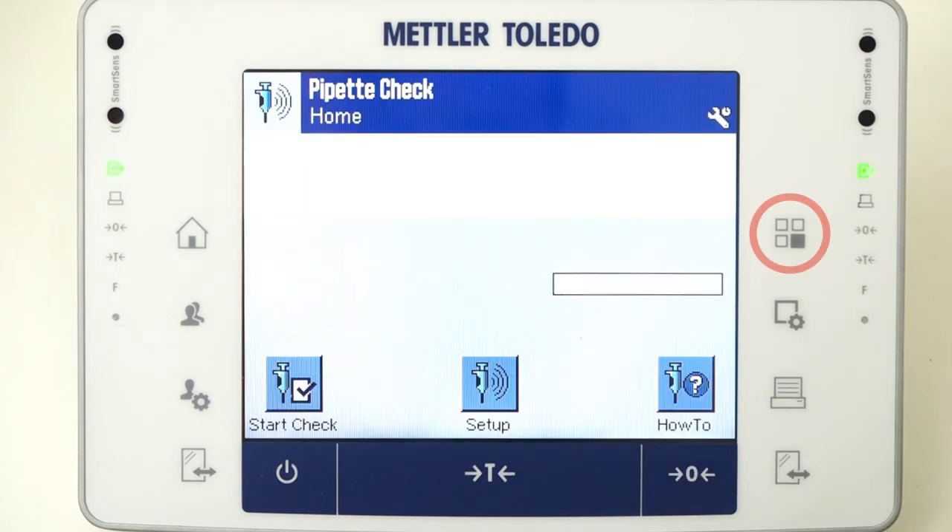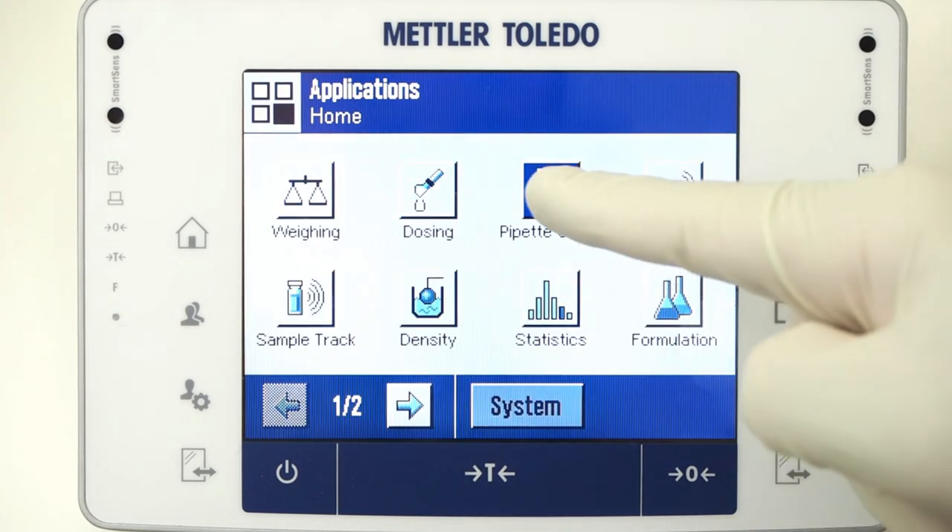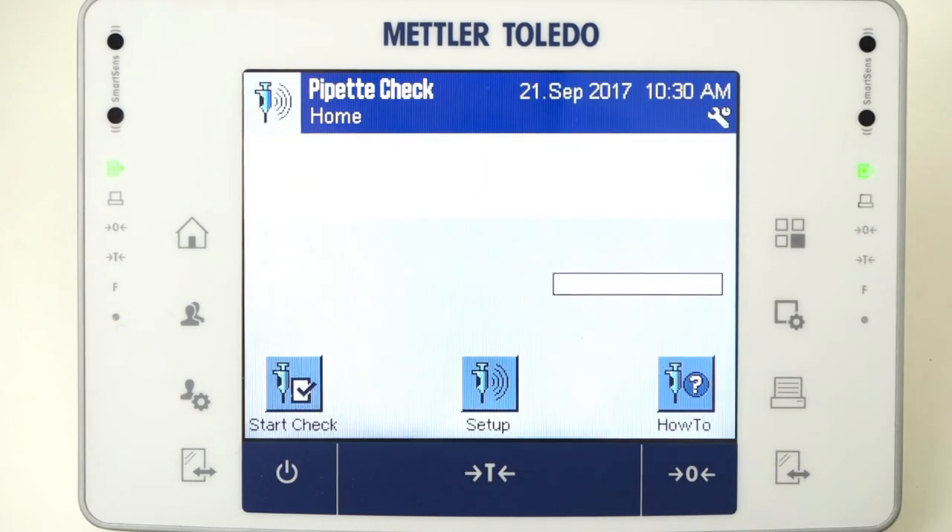Press the square select button outside the screen and choose Pipette Check. The balance and EZDirect Flex RFID scanner are set.